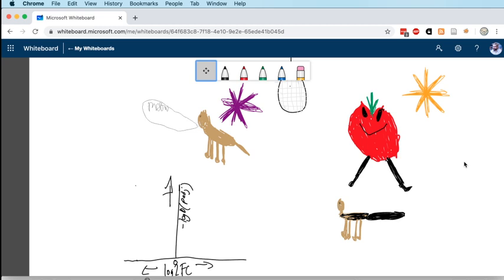As we discussed yesterday, if you find the logarithm of a number between 1 and 0, sort of a decimal, then you get a negative number. So if you find the log to the base 10 of the p-value, then you've got a negative number, and so we just transform it into a positive number by finding the minus log, so that the more significant your p-value, so the smaller your p-value, the higher the minus log 10 p-value is.